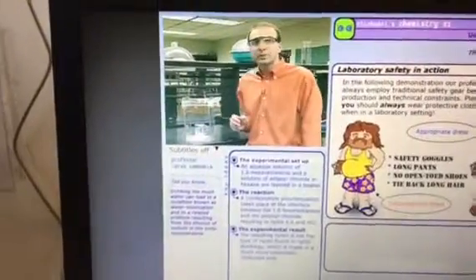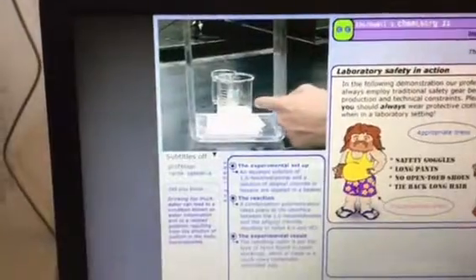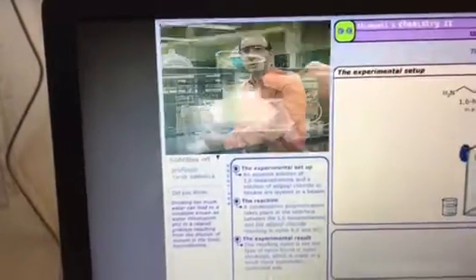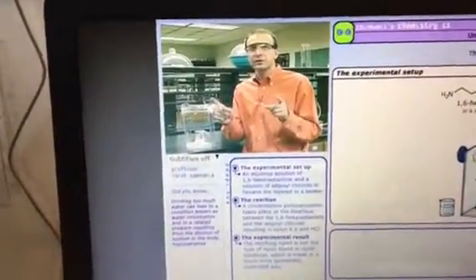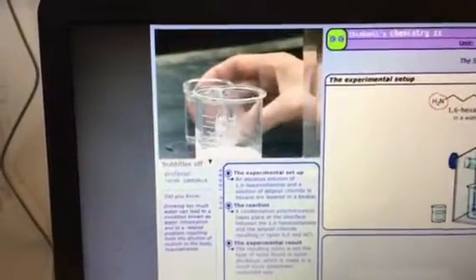In this demonstration, we're going to make nylon. What we have here are two solutions. One solution is a water solution of 1,6-hexamethylene diamine. This is a molecule that contains amines at the very end of 6 carbons, 1 on each carbon. This is a solution of adipoyl chloride.